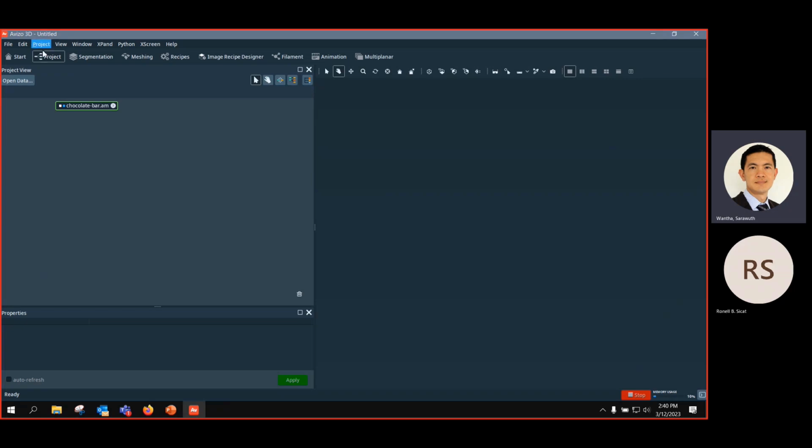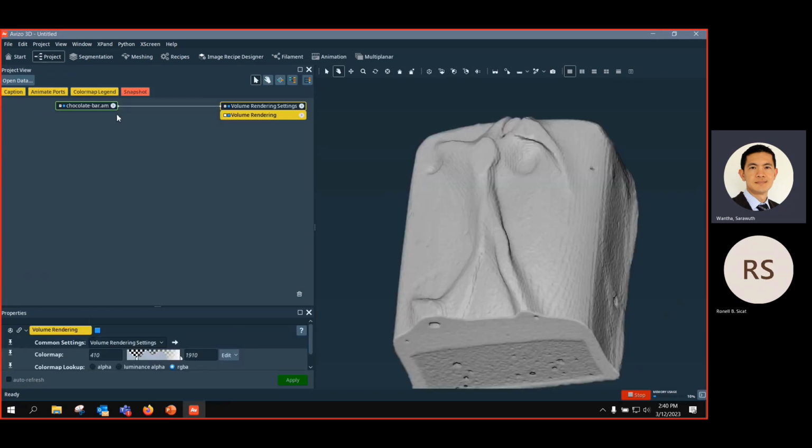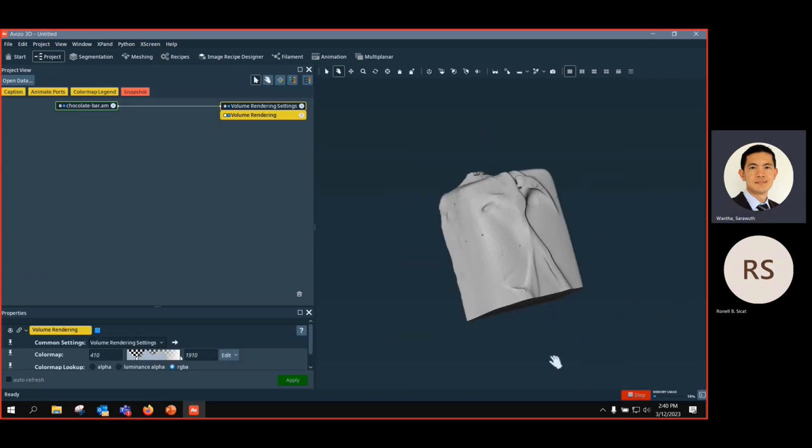Also imagine you have a very large 3D volume, like maybe a 10 GB CT data set. Instead of applying all the parameters and executing, only to find the result is not what you expected, when you click run, even a non-local means filter is going to take forever, and at the end you don't get a good result and you waste a lot of time. So that's why we come to this new workroom called Image Recipe Designer.